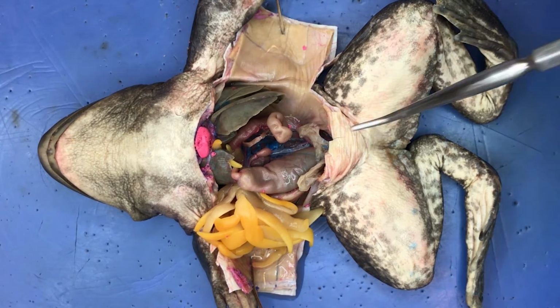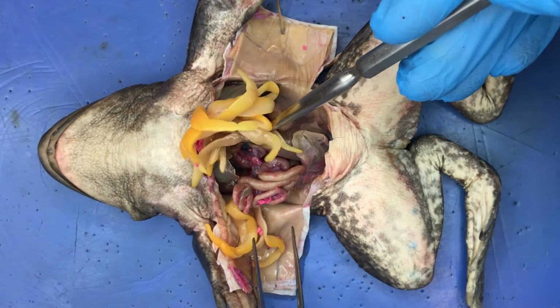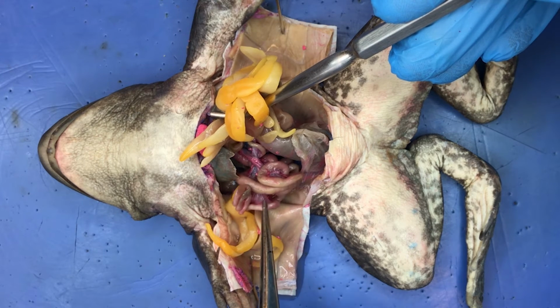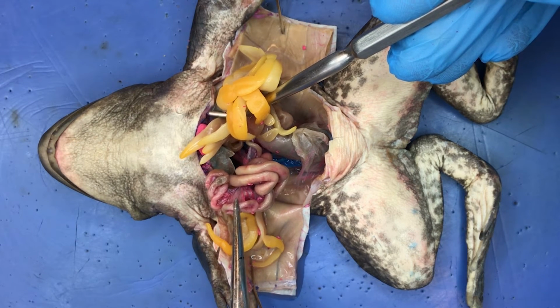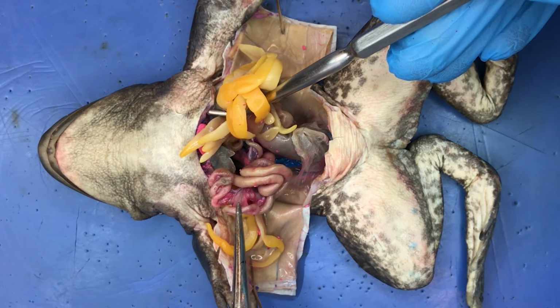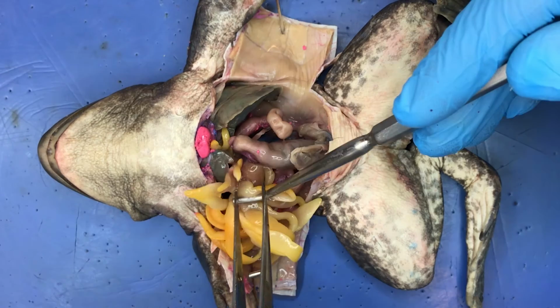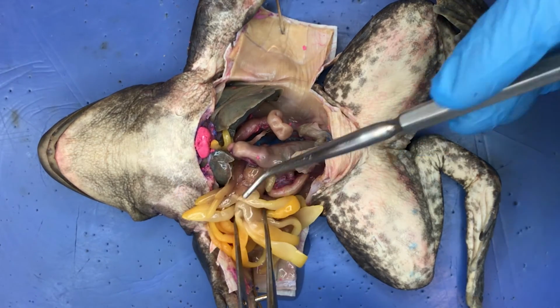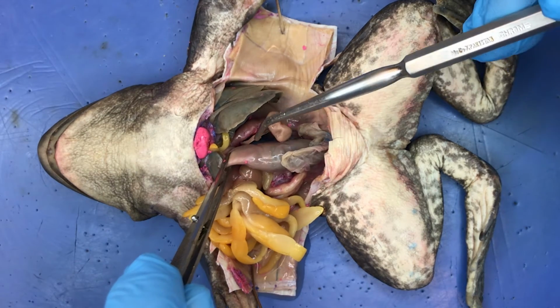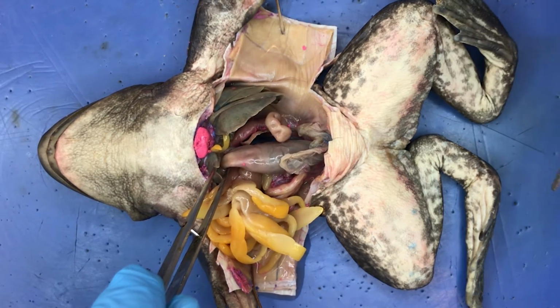Beneath the fat on the animal's right side, the small intestine continues and is coiled. It then enlarges in diameter and forms the large intestine, which empties its contents to the outside through the cloaca and vent.